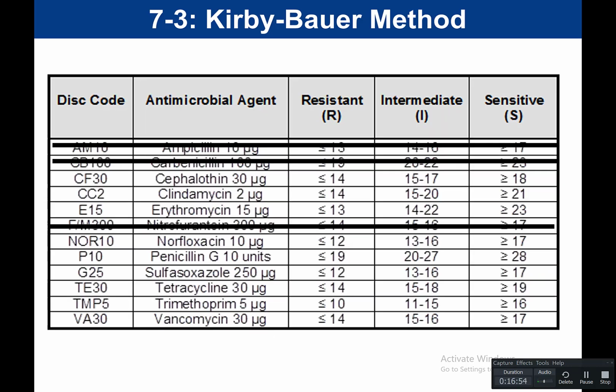So when we do this test, we have this standardized chart that we look at in order to determine if the bacteria are sensitive, resistant, or intermediate to a particular drug.